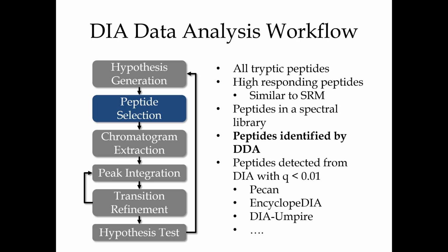One of the most interesting things that I've seen developing, and we're going to actually talk about this 2015 paper by Bruderer from Biognosis that I thought was very eye-opening, was that with DIA you don't necessarily have to do quantification on the same data that you develop the assay with, right? So you don't have to go to your quantitative runs and just query everything.